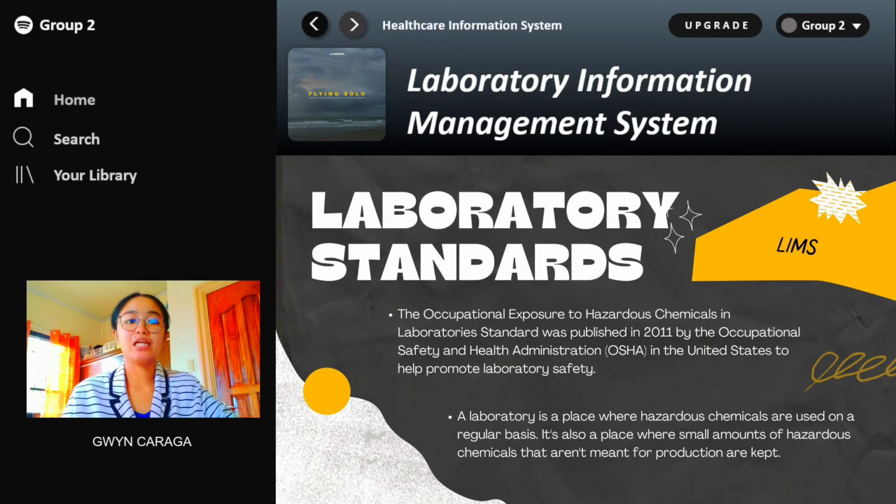They published it because they want to help promote the laboratory safety inside the laboratory. A laboratory is a place where hazardous chemicals are used on a regular basis. So, we all know naman that inside the laboratory there must be or there is a hazard or a risk. So that's why they publish the occupational exposure to hazardous chemicals in laboratory standard, because they want to help promote laboratory safety.